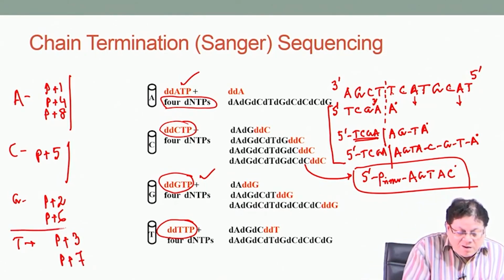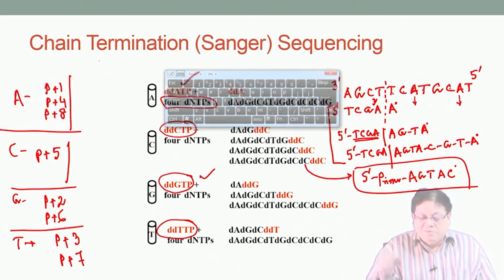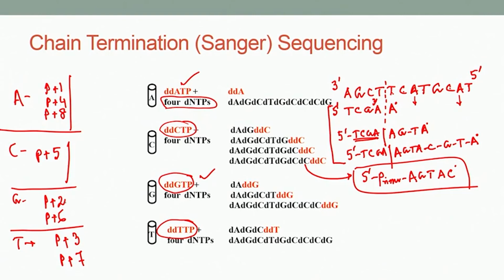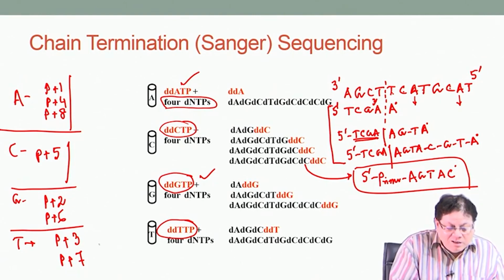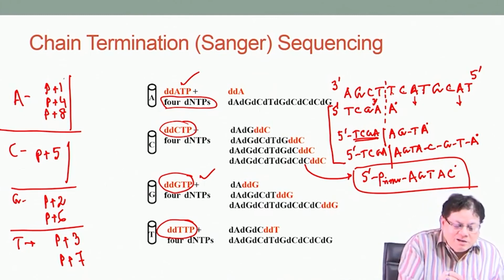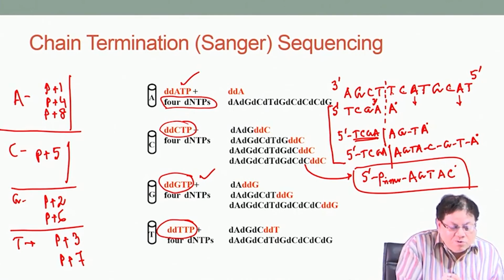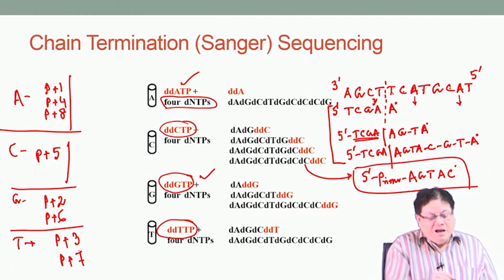That means all these test tubes are giving oligonucleotides which are varying in length. This is one, then the second one in molecular weight, if we go from decreasing to increasing. So, here it is the least molecular weight piece, then the second one is in the G lane, and the third one is here in the T lane, the fourth one is here, fifth one is here, sixth, seventh, okay, and then eighth.